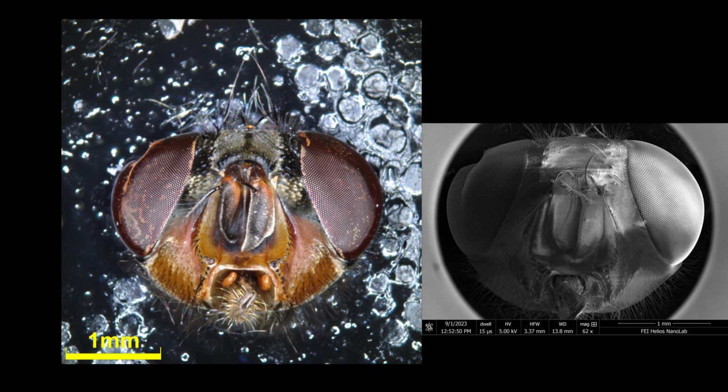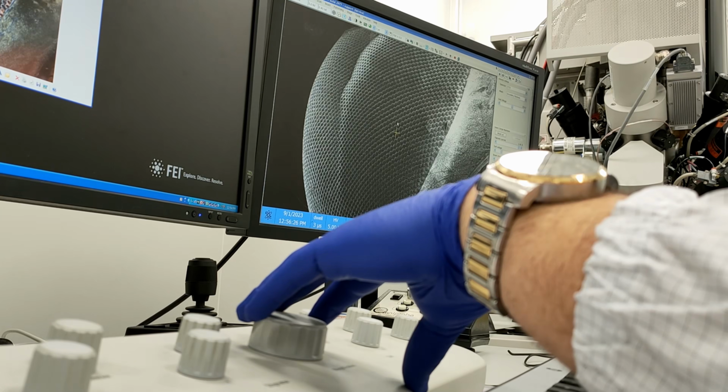Now let us compare the fly's eye images. The first obvious difference is color. Electrons do not see color. SEM images are always black and white, or more precisely monochromatic. They represent the intensity of interaction between the electron beam and atoms in the sample.